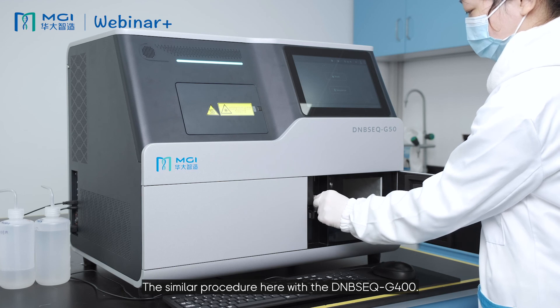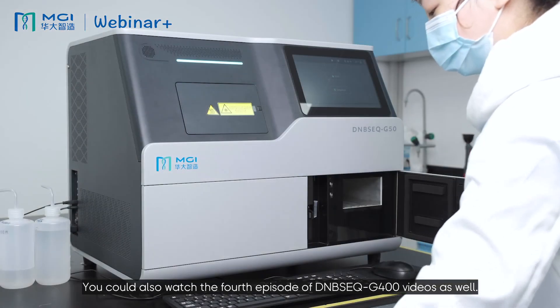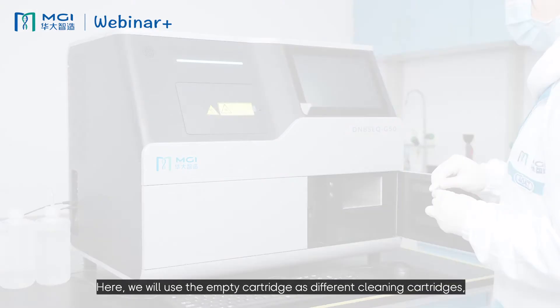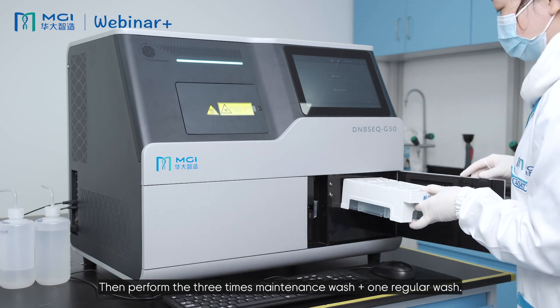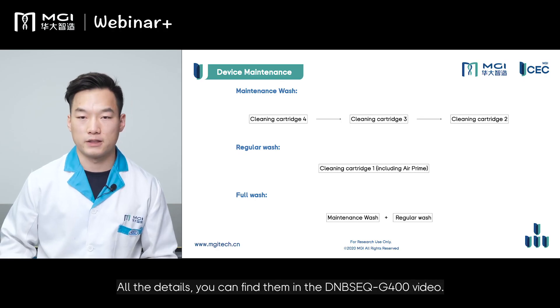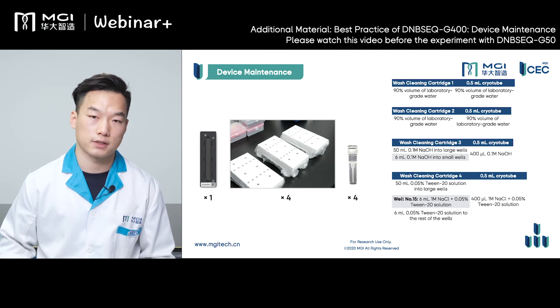The maintenance procedure here is similar to the DNBSEQ-G400. You can also watch the fourth episode of the DNBSEQ-G400 videos. Here, we will use empty cartridges as cleaning cartridges, filled with sodium hydroxide, deionized water, or maintenance water. Then perform three maintenance washes plus one regular wash. All details can be found in the DNBSEQ-G400 videos. The only difference is the filling volume in each of the separate cleaning cartridges.